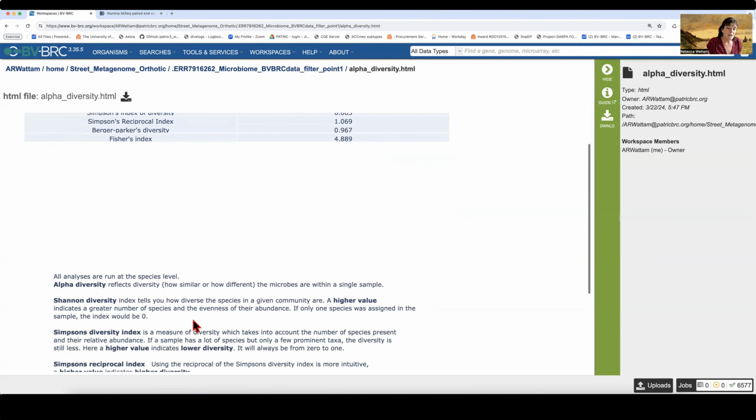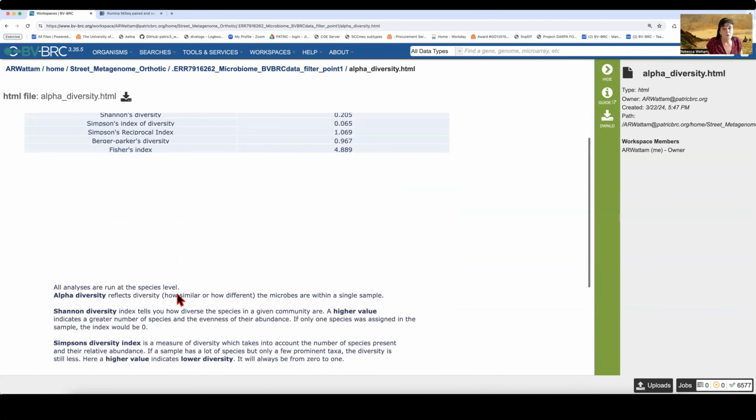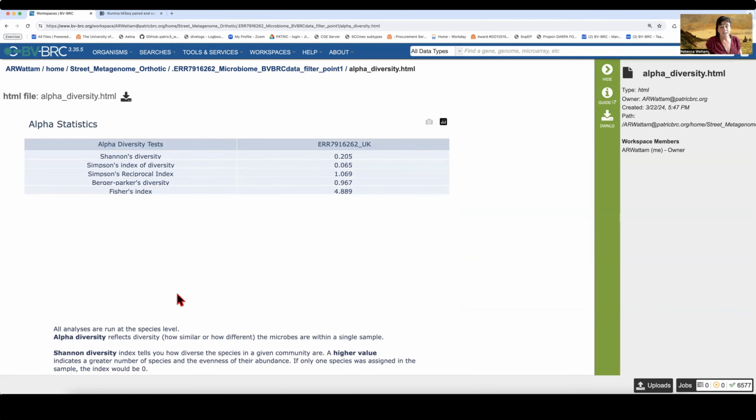So you can use all of these things. You can knock yourself out and explore all of the different diversity indices. But, you know, we have the visualization of that. So we're good. I think this explains it. And you can maybe even slip that into your publication if you want it to look like you were up on your statistical analyses.